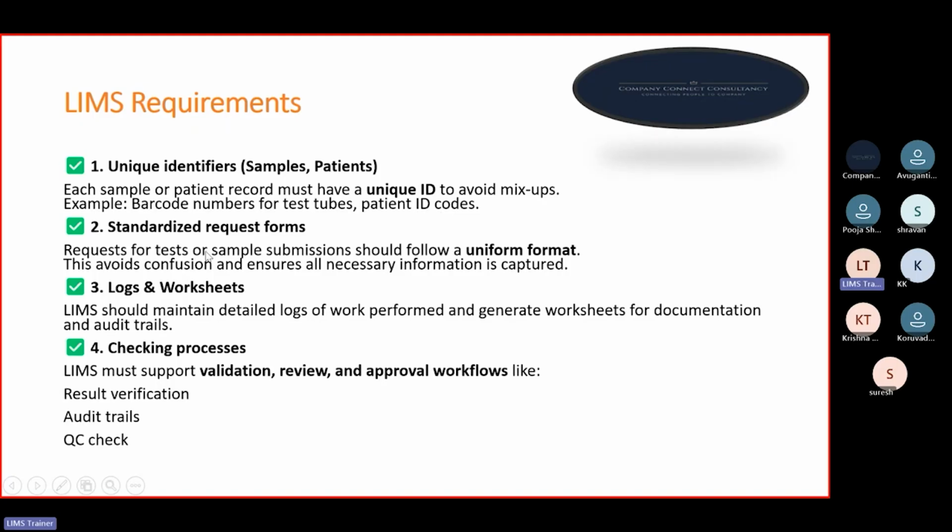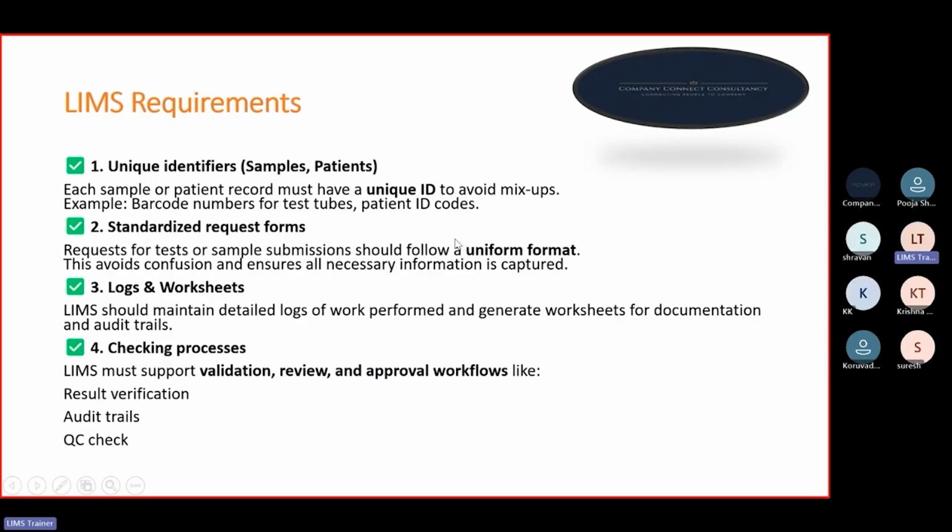Okay, standardized request forms. Requests for tests or sample submission should follow a uniform format. This avoids confusion and ensures all necessary information is captured. Logs and worksheets. LIMS should maintain a detailed log of work performed and generate worksheets for documentation and audit trails, right? So these are the logs and worksheets that should be maintained by the LIMS for documentation purposes and the audit trails.